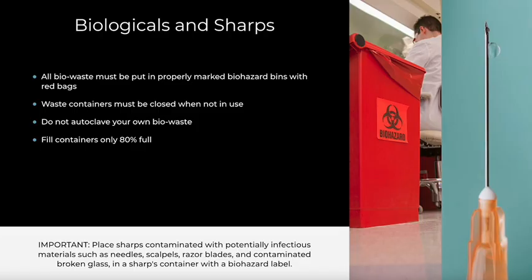Place sharps contaminated with potentially infectious materials such as needles, scalpels, razor blades, and contaminated broken glass in a sharps container with a biohazard label.